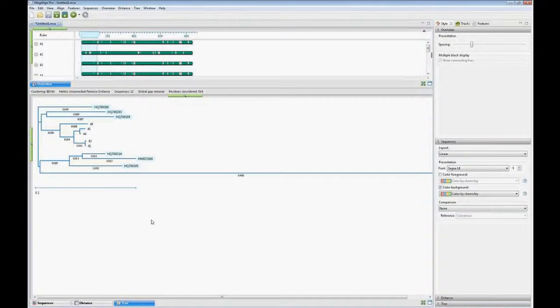of interest. You can also rerun the alignment using a different method. You can see it all happens pretty quickly, so it's very easy to tweak things and adjust just depending on your project and your data.